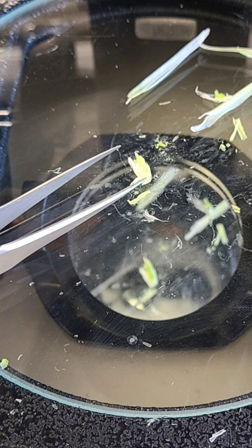So none of these are at the stage I want, and I hope you get an appreciation of just how tiny these things really are. With them not being at the right stage, though, we do have to reconvene tomorrow and make a new plan for when exactly we're going to do these dissections. Maybe wait until they're at 6 leaves instead of 5.